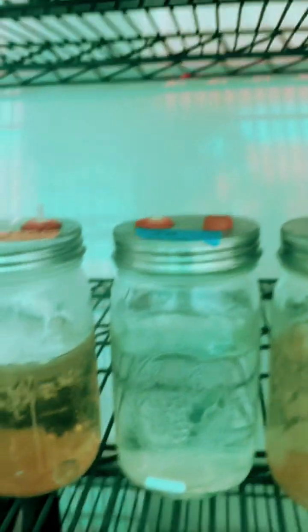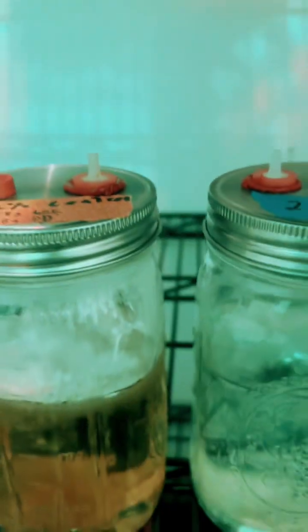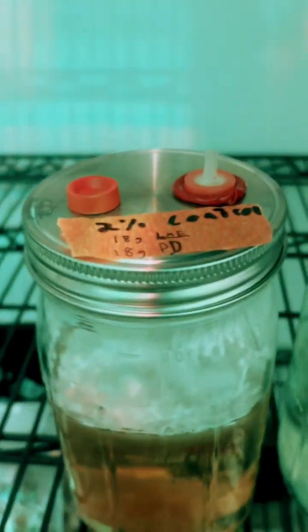Hey everyone, it's Julian at Liquid Fungi and here are the results of our rye berry testing.